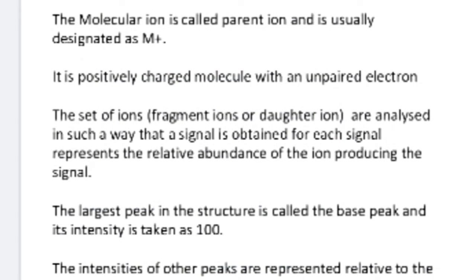Next, the molecular ion is called the parent ion and is usually designated as M plus ion. It is a positively charged molecule with an unpaired electron. So, we would like to explain the molecular ion: it is a completely positively charged molecule, and it has an unpaired electron.